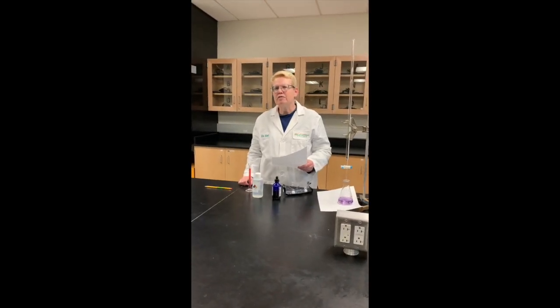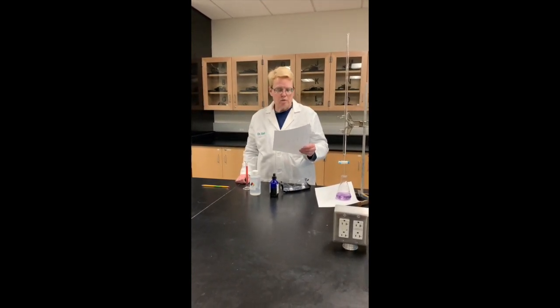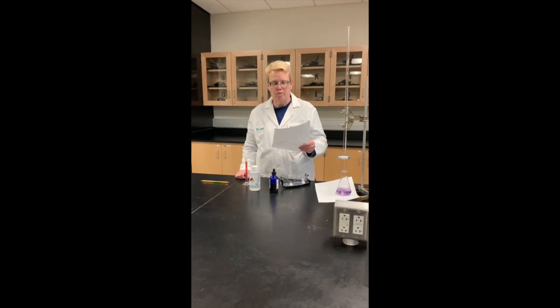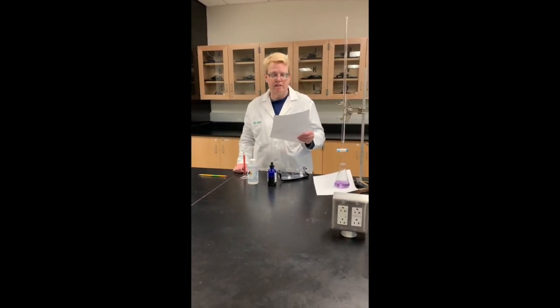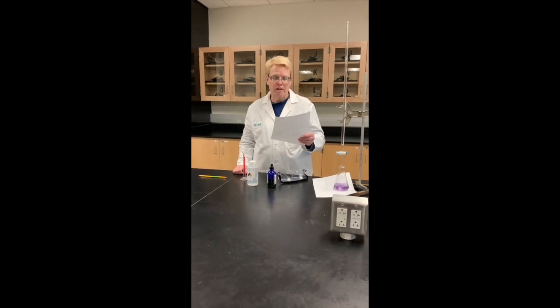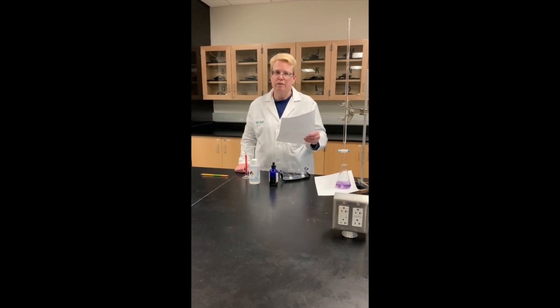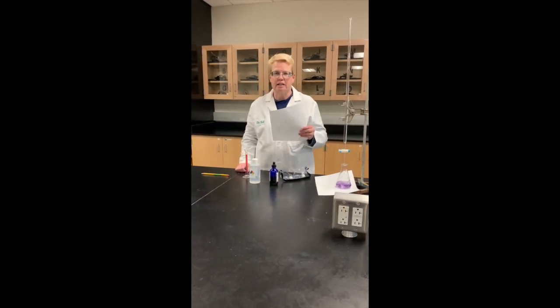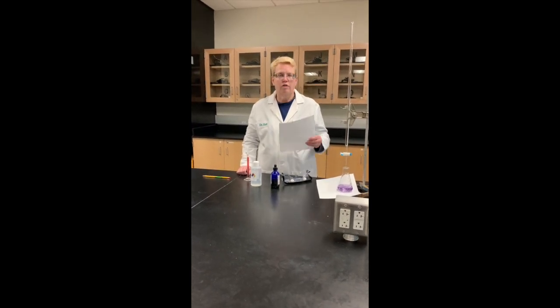So we completed the final 2 trials of the hard water sample, and in trial number 2, we still used a 50 milliliter sample of the hard water. Our initial burette reading was 1.02 milliliters of the EDTA, and the final burette reading was 29.32 milliliters. In trial number 3, we used 0.5 milliliters as an initial volume in our burette, and 30.01 milliliters as our final volume in the burette. And remember, the burette contains the EDTA. With all this information, you should be able to determine the water hardness in this sample.